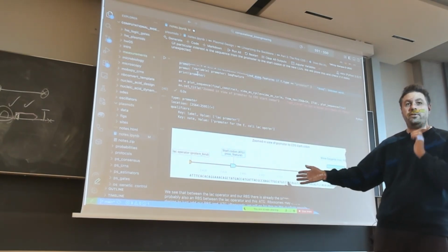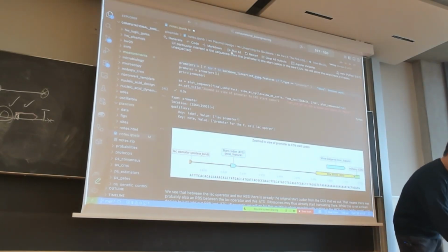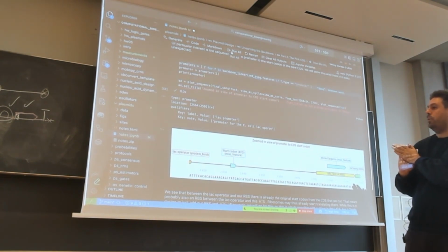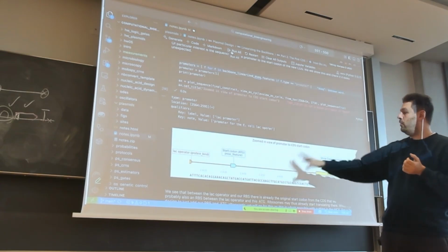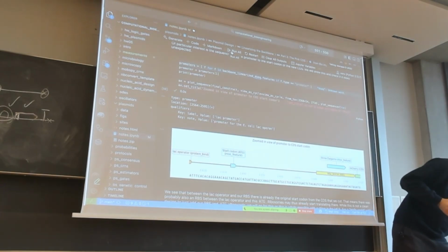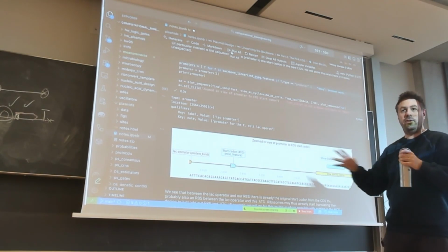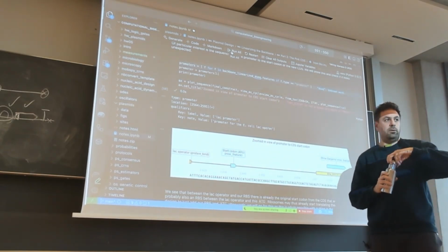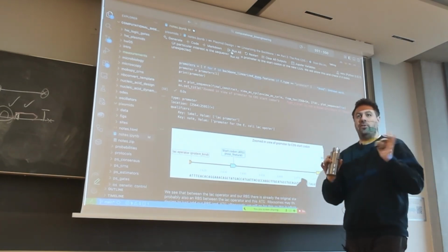So in the end I can just run play here, and it tells me if everything is correct. In other software, I would have to take this sequence and do a simulation there. Of course I can do that, but I could not add some other assertions, for example, are our two promoters here and so on. So I would really advocate the code usage here. Hope this answers the question.